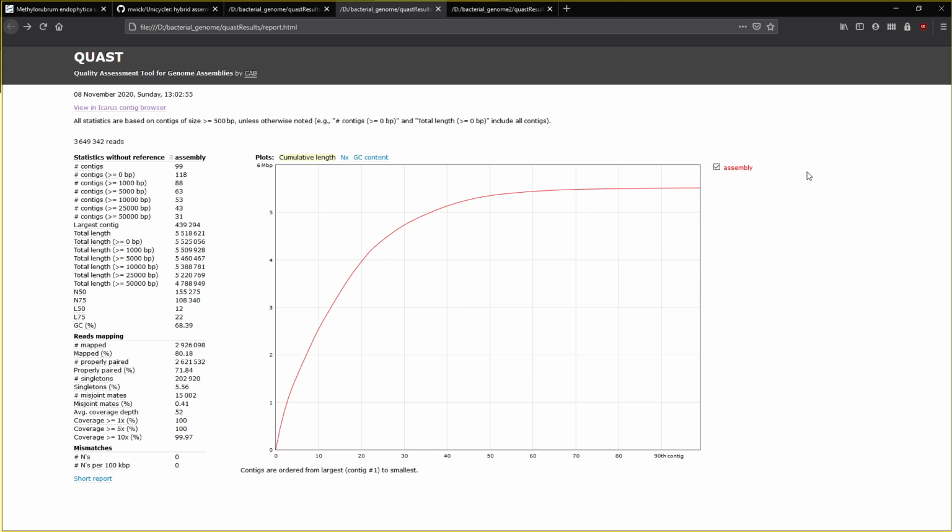So that can all be handled in something that's called a workflow, and the workflow will let you basically move the workflow file to another folder and then run the same pipeline but on a different set of data. So it can automatically pull in the data from a folder. So as long as you have all of your files in the same raw reads folder, it'll be able to do everything else that you want it to.